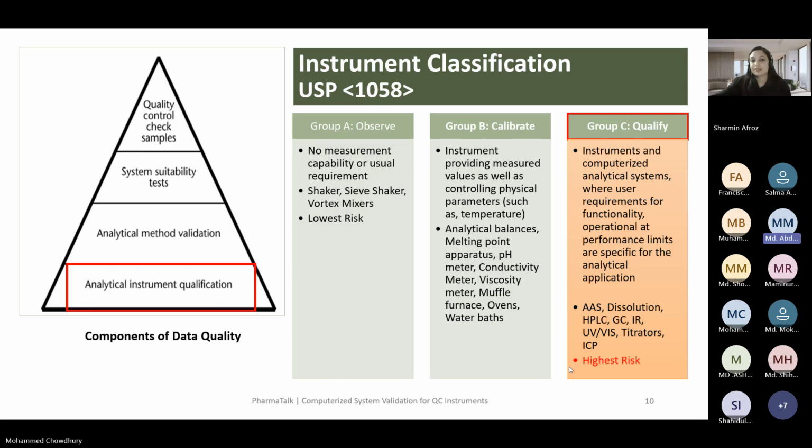Am I right? Let's say Excel system based, but the software should be purchased periodically from the supplier, and we need to use it. Actually, we cannot modify the calculation. We just make sure the right calculation is being used or not.